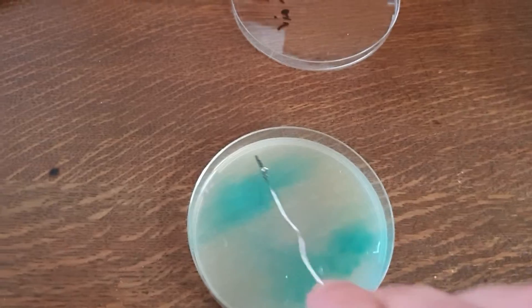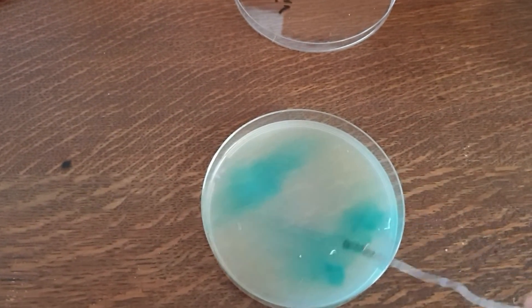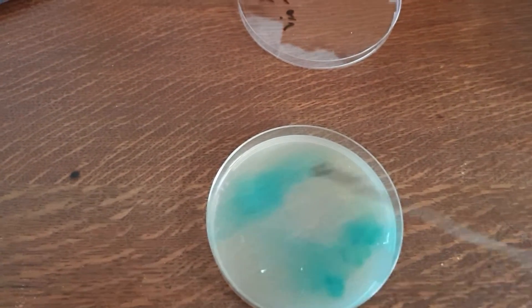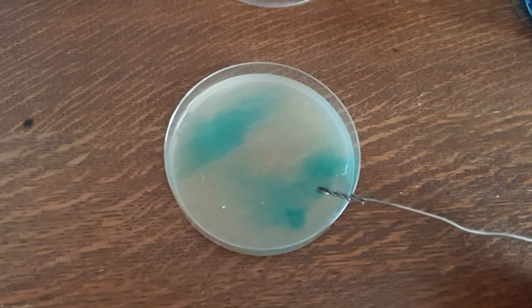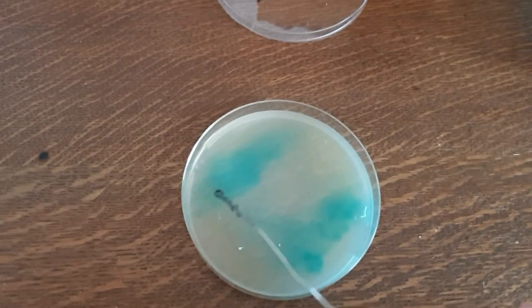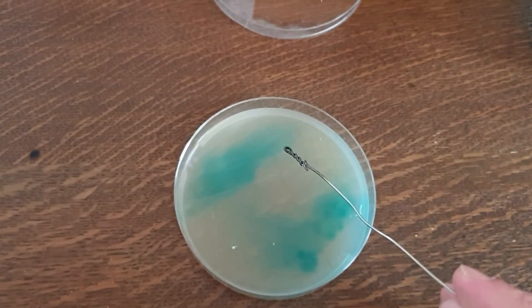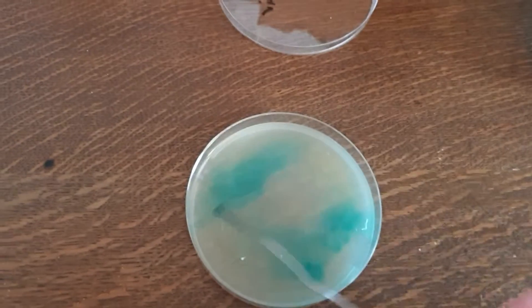Then you streak again at an angle like this, and then you streak again, and you can streak again — you've kind of formed a pentagon or hexagon shape, whatever. The idea is that up here you'll have a clump of spores and a big clump of bacteria as well, probably, and whatever else — mould.